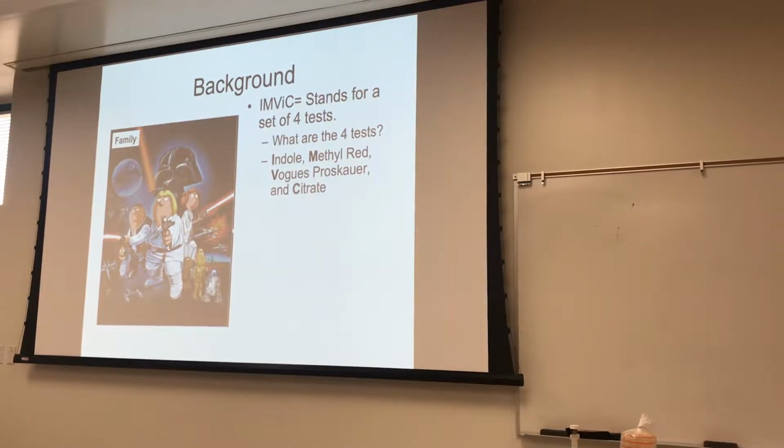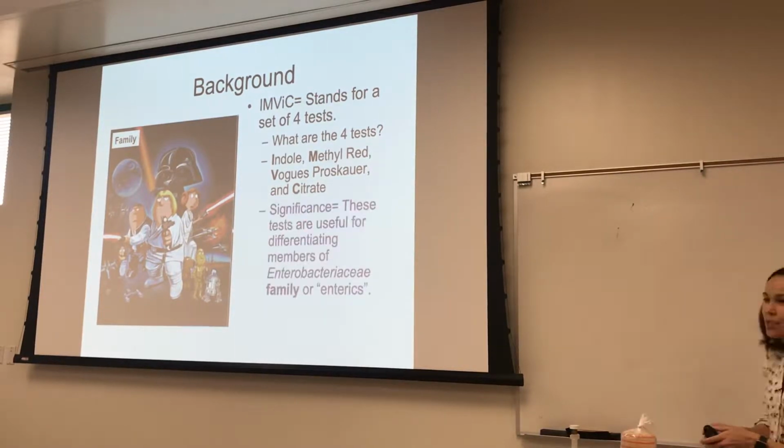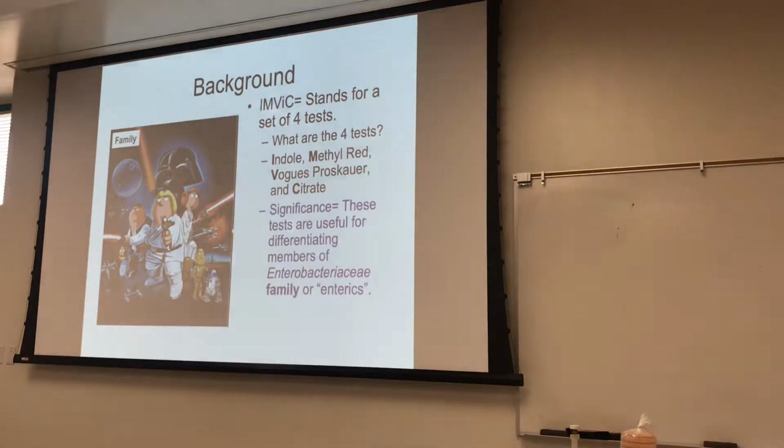So the only reason we're mentioning this little subgrouping of experiments is because when we get to our unknown, which is not too far away, everybody is going to set up IMViC during your project.